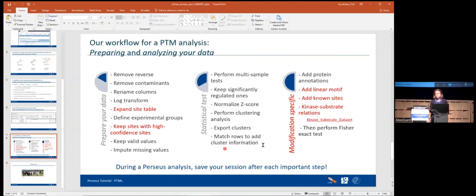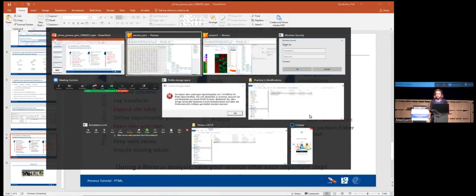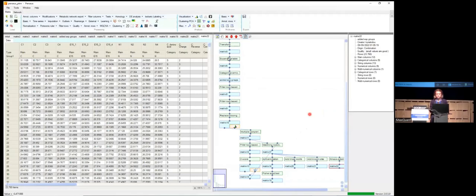These are the steps I wanted to show you. You do the Fisher exact test and find the enrichment. That's all — thank you.